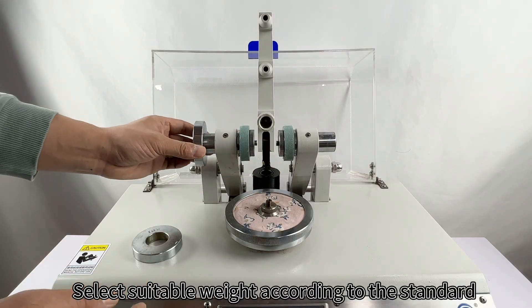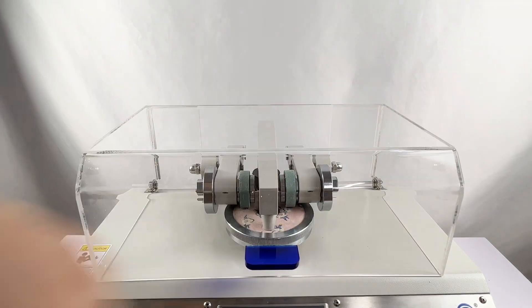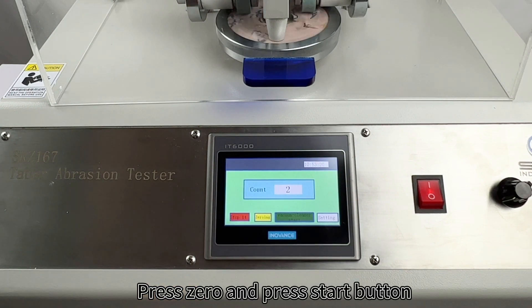Select suitable weight according to the standard. Put down the abrasive wheels and cover. Set the parameters. Press 0 and press the start button.